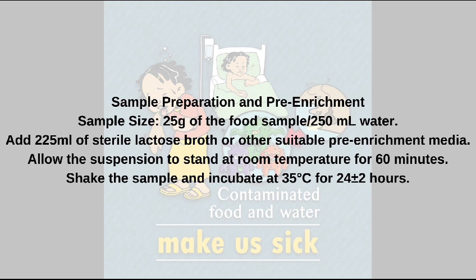After that, if we are considering a solid food sample, we have to make a uniform suspension by blending if necessary. The container which we have taken should be of wide mouth and it should have a screw cap. After blending, the container is capped and it is let to stand at room temperature for 60 minutes.